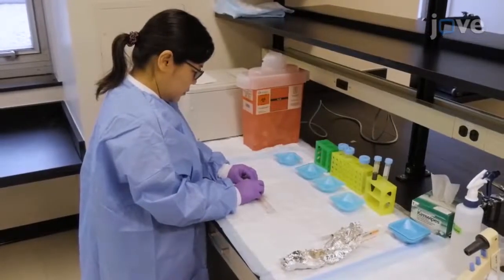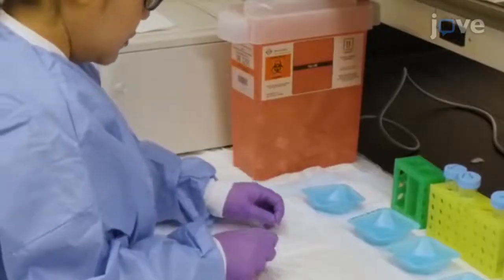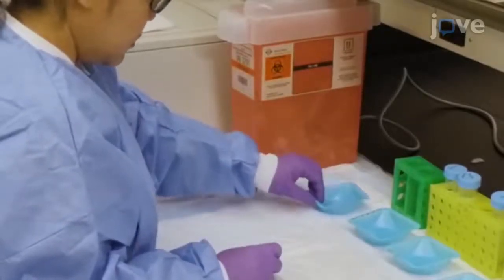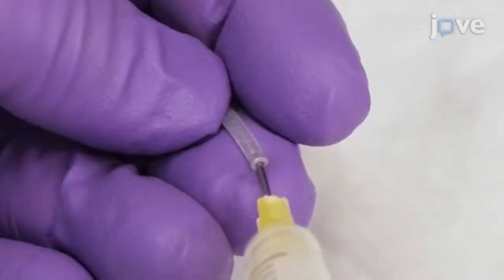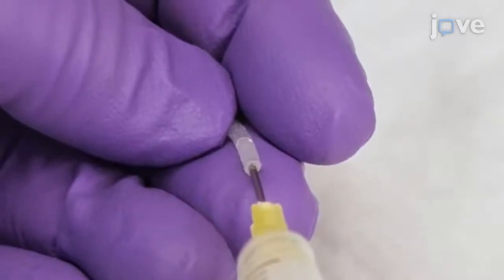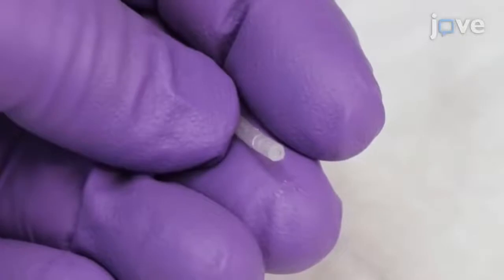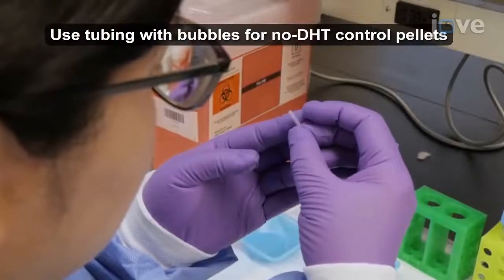For dihydrotestosterone, or DHT, pellet preparation, use a razor blade to cut a 15mm piece of silicone tubing, and use a 3ml syringe equipped with a blunted 20-gauge needle to inject 2-5mm of medical adhesive silicone into one end of the tube. Allow the tubing to dry overnight and check for air bubbles on the sealed end.